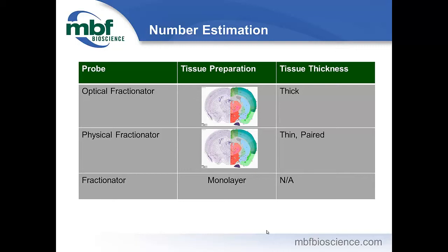And so when you're counting, you're actually counting what appears on section 1 versus what is no longer there on section 2 for each pair of sections through your systematic random series. Yeah, and the reason you need pairs of contiguous sections is because we need to look in one section and see that the cell is there, and the next section and see that it's not there. Then we'll know that we found the cell top.